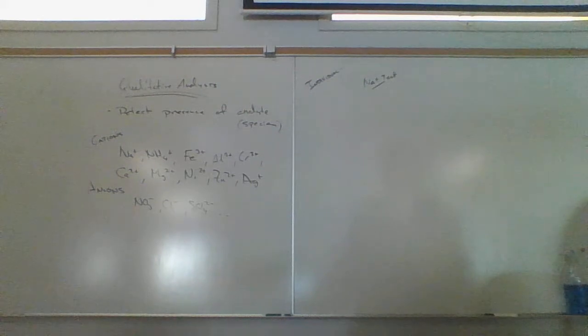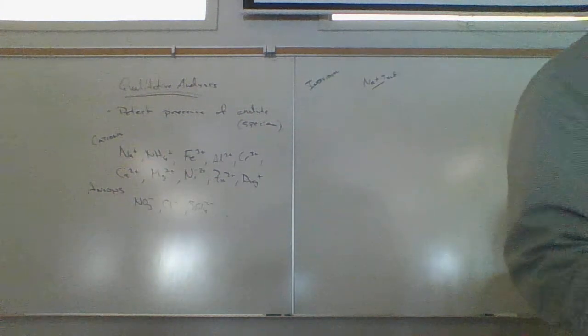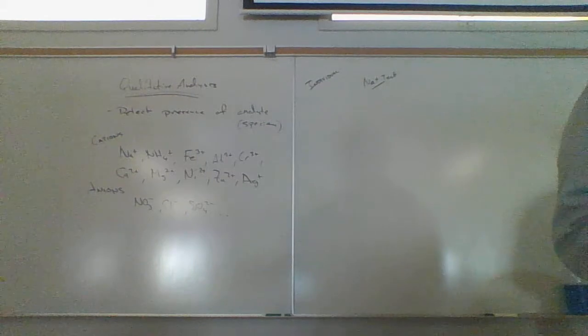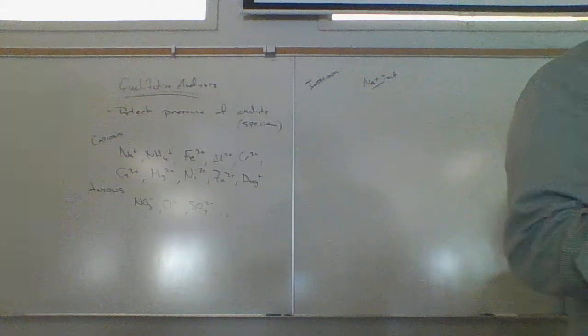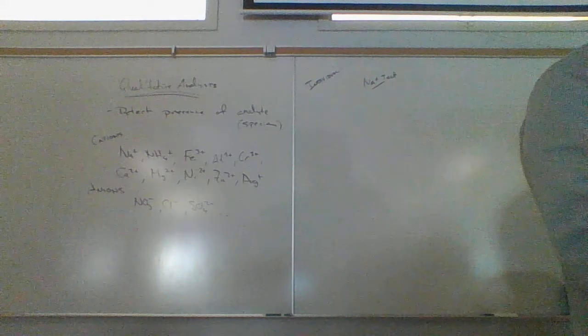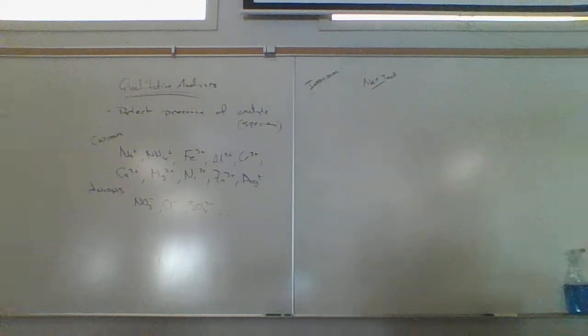All right, but what's going to happen is that the wire is going to burn clean. That is, there should be no color to the flame other than the blue color of this. Now the problem with sodium is this test is so sensitive. It just takes a tiny bit of sodium to cause a positive test for this. That tiny bit of sodium can come from fingerprints. So did you see that color there? Or can come from contamination. Like, let's take a look at this here.